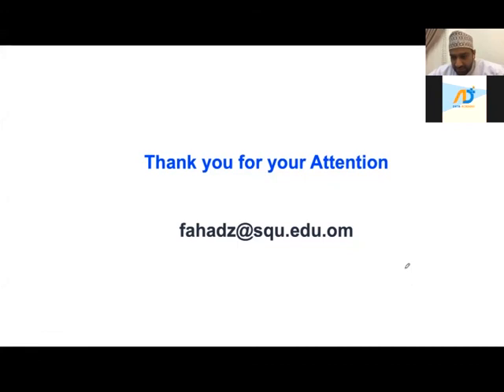Can you please cover more on epigenetics in the next version? Shadan is asking about RT-PCR on epigenetics. Of course, maybe we can have a separate workshop on epigenetics, because in epigenetics, as I told you, you can use methylation-specific PCR primers, or you can use a primer that specifically binds, or you can use HRM. The principle is the same for both, it's just how you design your primer that is different. So yes, maybe we can discuss it when we talk about primer design.